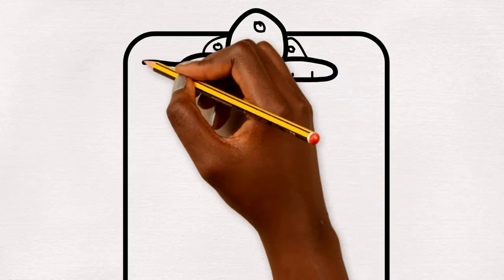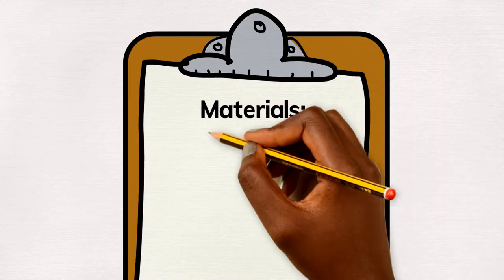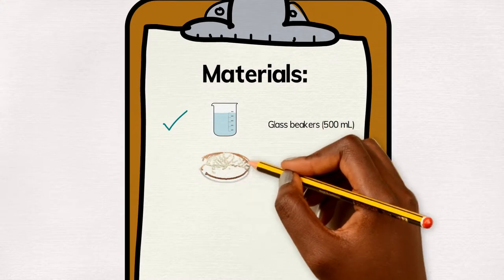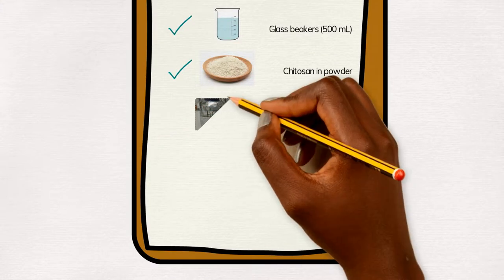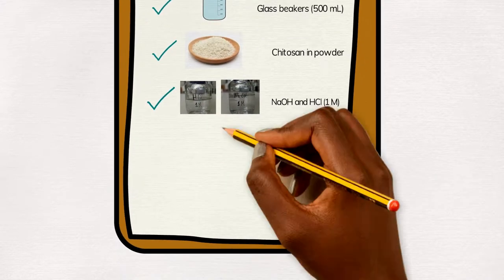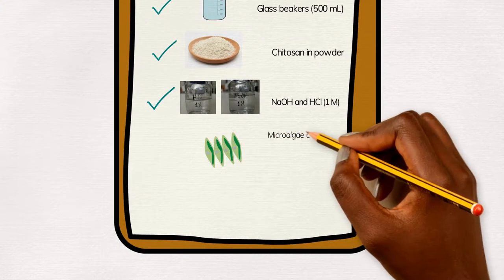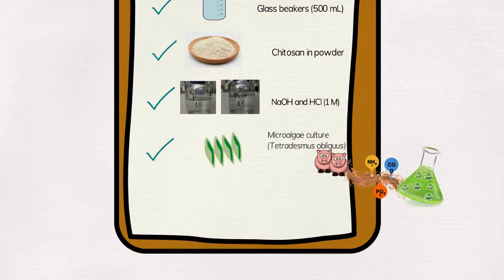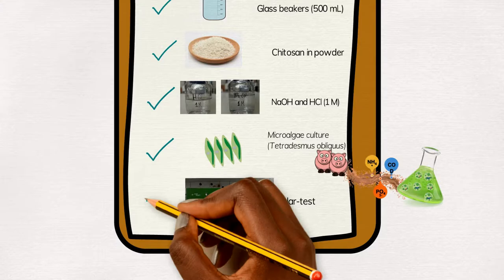So let's start! For this method we will need glass beakers that can fill 500ml, the chitosan stock, sodium hydroxide and hydrochloric acid at 1 molar concentration, the microalgae culture. In this method we use tetradesmus obliquus grown in piggery wastewater and of course the JAR test.